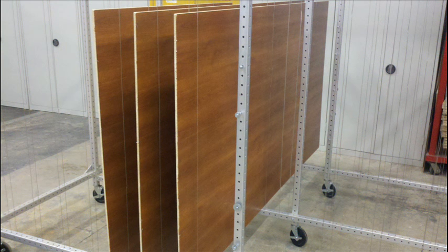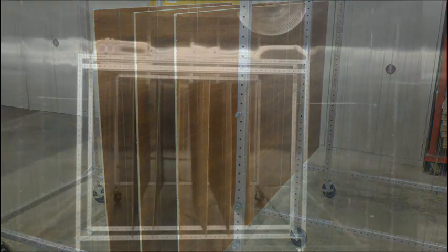This test method is a way to quantify how much newly manufactured panel products such as laminated particle board and Luan sheets contribute to indoor air quality and determine compliance with many regulatory agencies such as HUD and CARB.